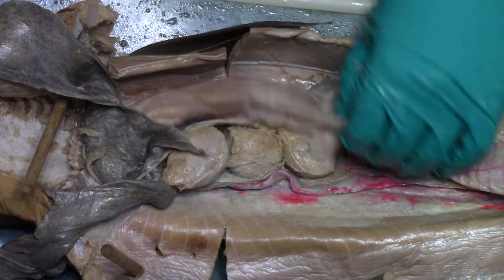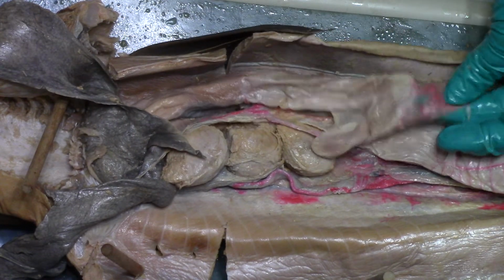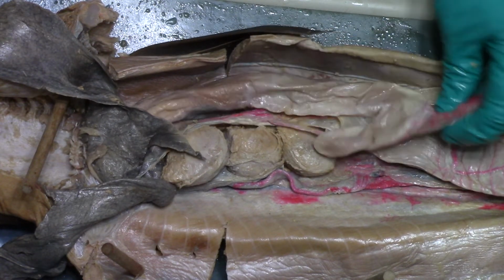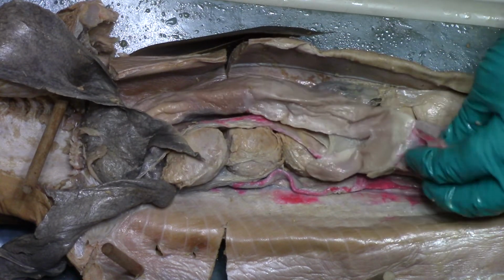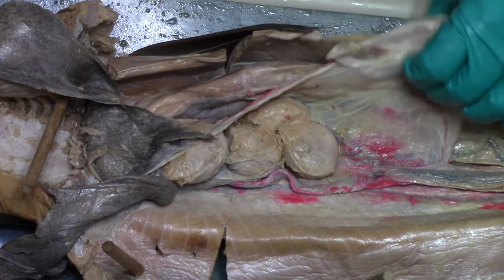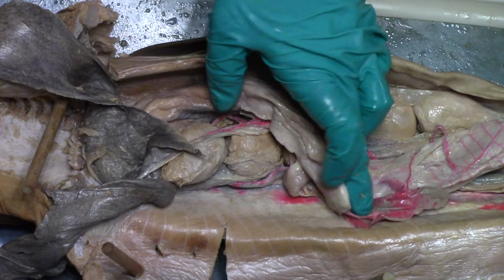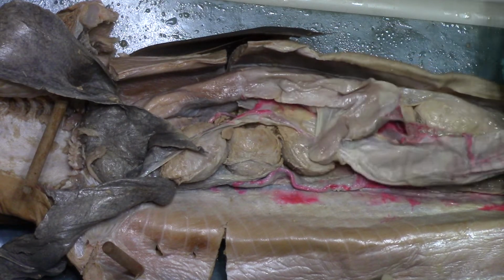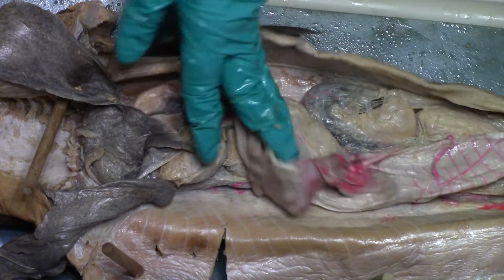I'm trying to find, we usually have a spleen and a weird pancreas I'm looking for. I wonder if this is the pancreas. I think that's what this is. This flappy mesentery, I think, is the pancreas. It's usually like this weird thin thing attached to the stomach. It's been a while since I've cut open a shark, but I think that's what the pancreas is. I think it's this thing sticking off here. And then the spleen is usually down here, sort of attached. Right here is the spleen.